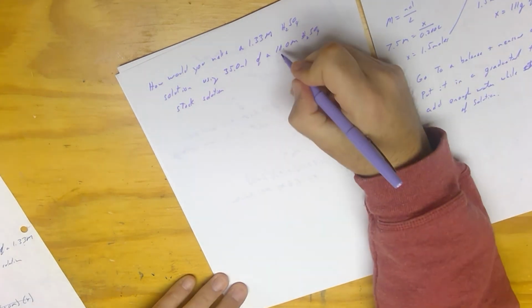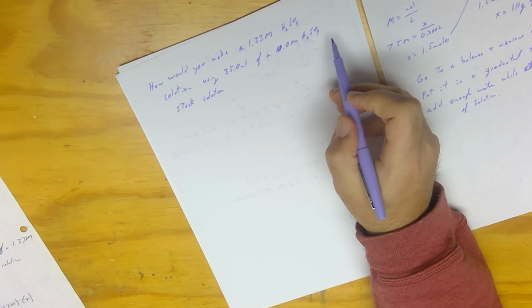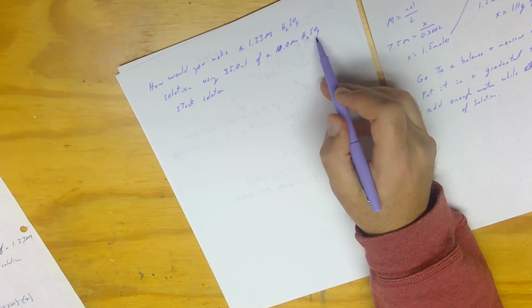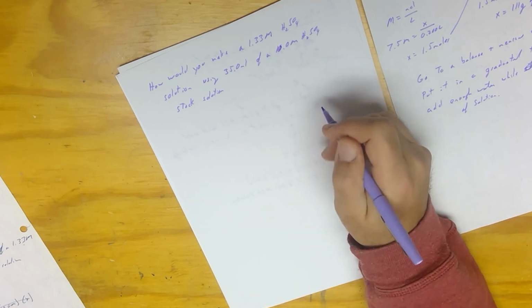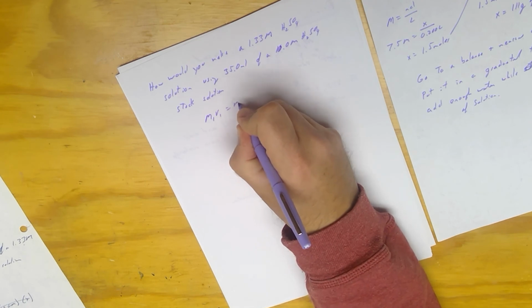All right, so this is another thing that I do all the time. Our acids, which is what H2SO4 is, come in a really concentrated form, and if I ever gave you 10 molar H2SO4 during a lab, you could really burn yourself, so I have to dilute this down. So this is a dilution problem. I'm going to use M1 V1 equals M2 V2.